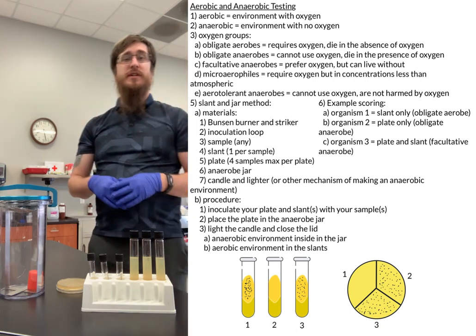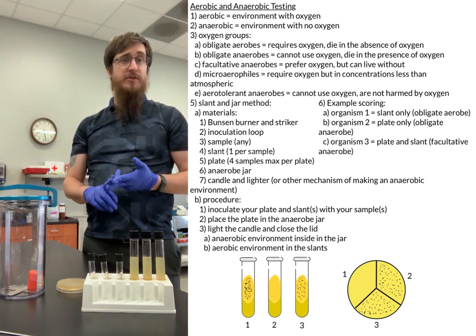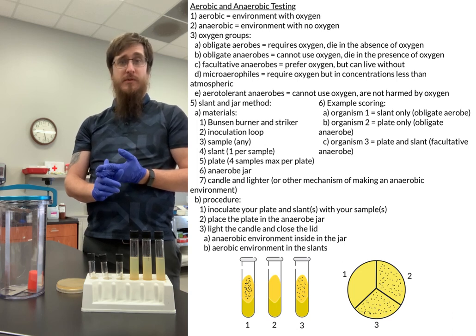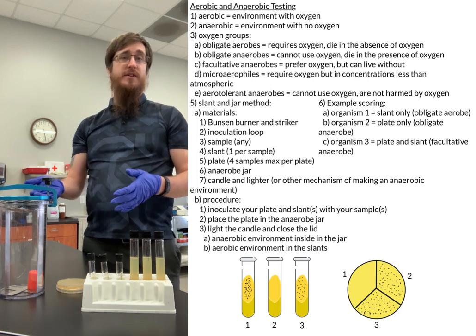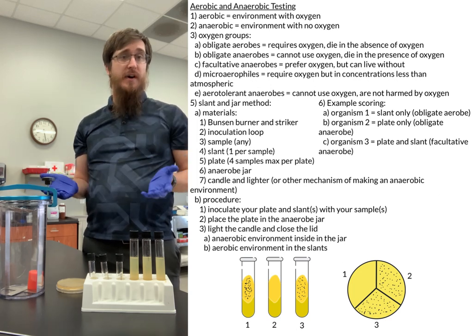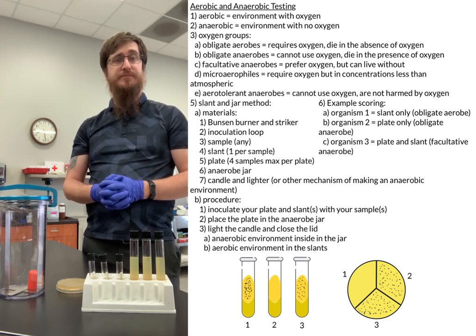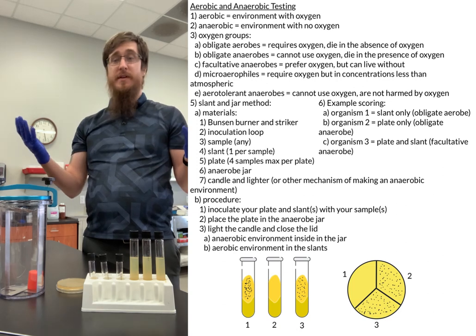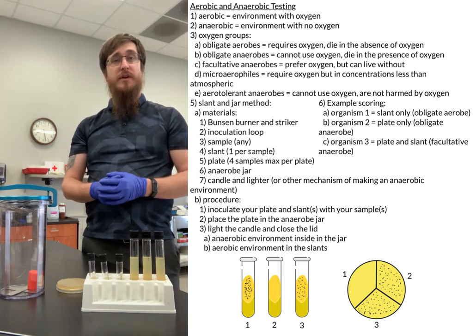When it comes to our class, though, that's not really that big of a deal, because microaerophiles and aerotolerant anaerobes are pretty rare. We're not really going to be working with them. We're only going to be working with the 3 standard groups. So either one of the techniques works perfectly fine for what we're trying to do for our class. But I think with that, I don't have anything else that I need to introduce on the aerobic versus anaerobic testing that we're going to be doing in class.